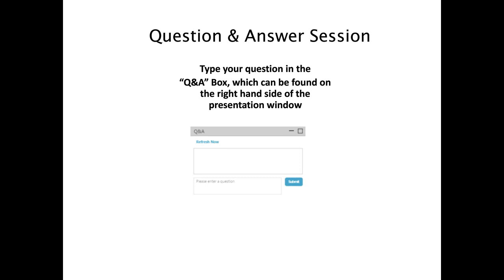Our next question is, how does the method development approach change when using a mass spec as a detector? Well, frankly, I don't have a lot of experience with developing mass spec methods per se. Certainly, with a mass spec method, you have to make sure that you have conditions and a column that can be used under the conditions that are going to give you good sensitivity for your analytes. And of course, you can use flow injection experiments for that type of approach.